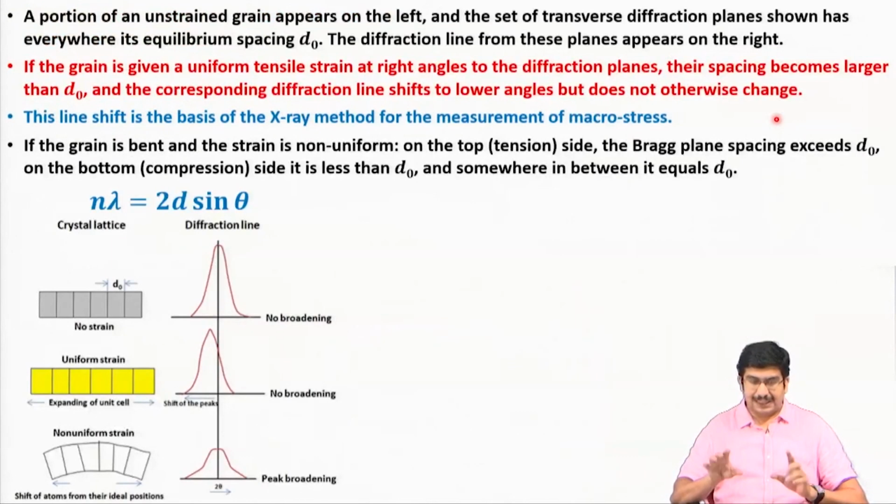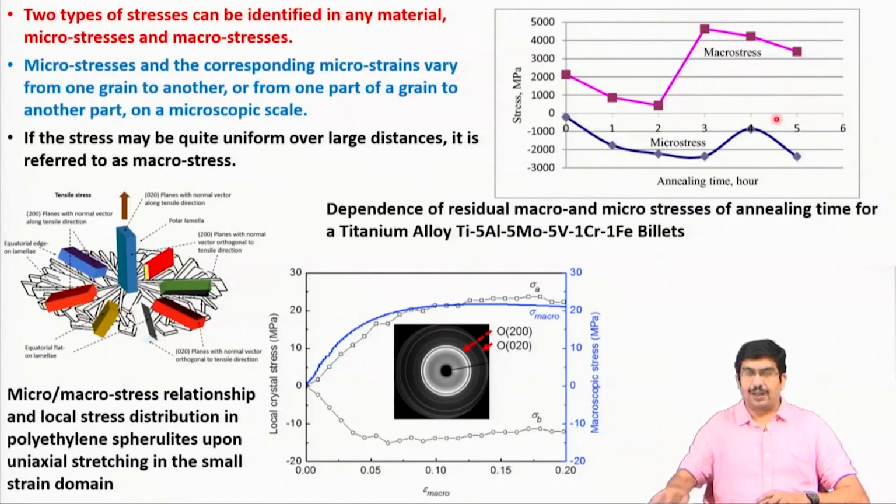Now, let us see how these two stresses act on the X-ray diffraction profile, what is their effect, what they do, and how we can make out the extent. This entire thing is basically determined from the X-ray diffraction profile, both the macro stresses and the micro stresses, and we can discuss how these things are determined.